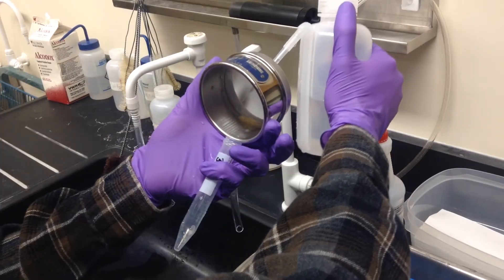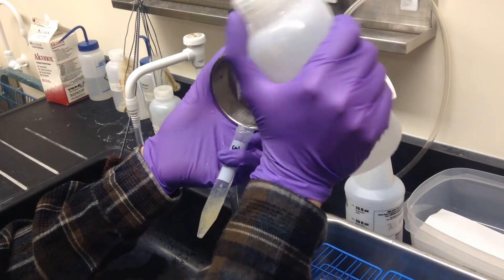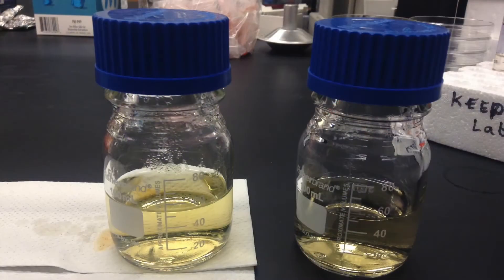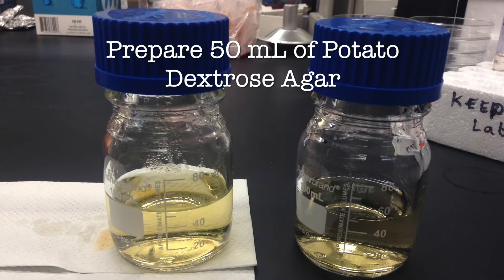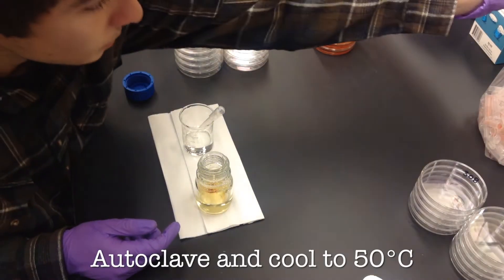Once the samples have been washed we'll collect the remaining sample in a 15 milliliter tube. For each sample you need to prepare 50 mils of potato dextrose agar or PDA. These need to be prepared in advance and individually for each sample.